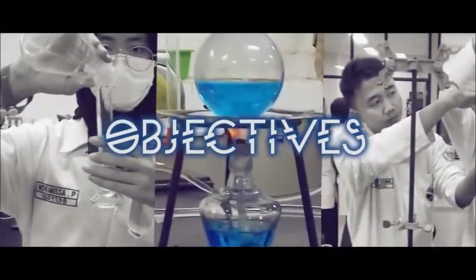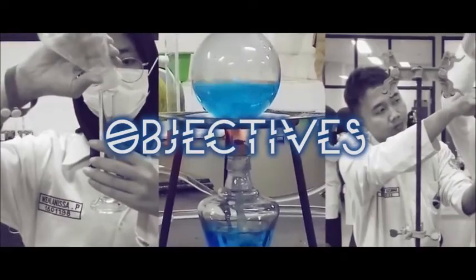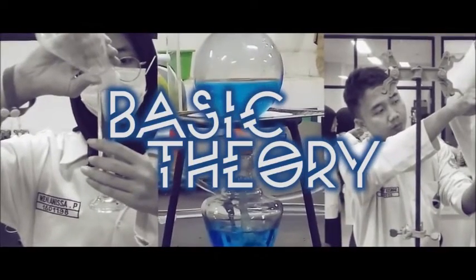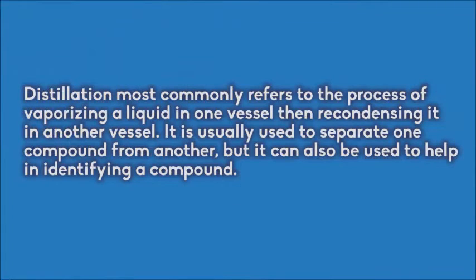The objective of this experiment is to separate a mixture using the distillation process. Distillation most commonly refers to the process of vaporizing a liquid in one vessel, then recondensing it in another vessel. It is usually used to separate one compound from another, but it can also be used to help in identifying a compound.